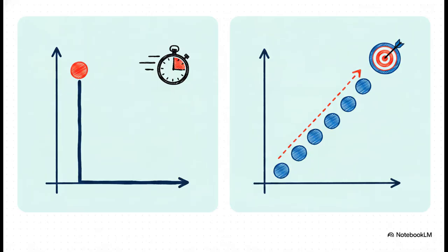Now, what we just walked through is called a single-point calibration. It relies on a single benchmark and assumes the relationship between concentration and area is a perfectly straight line going right down to zero. It's incredibly fast, and precision is actually increased if your known reference concentration is really close to your unknown. But if you're doing highly rigorous work and want maximum precision, you're going to use multi-level calibration. This involves preparing several different known reference amounts and using a linear regression method to plot a much more precise trend line. It definitely takes more upfront work in the lab, but it creates a much tighter net for catching the exact truth of your sample. And, wonderfully enough, this quantitative method is actually the only one adapted to gaseous samples.